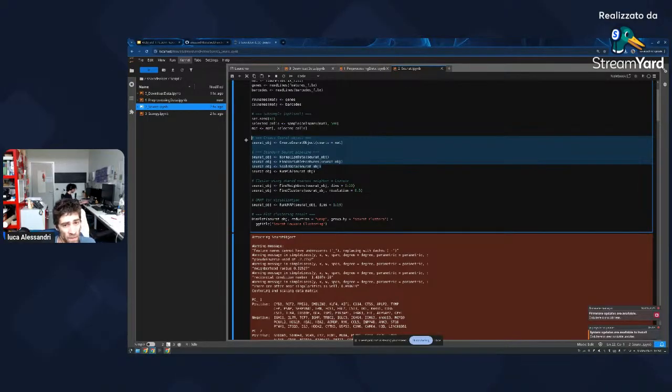There are plenty of other options. You can explore them, but as a first approach to do clustering, I believe that this is more than enough. And then, of course, you run the PCA. And this one is kind of what we saw before, but it's a bit different.